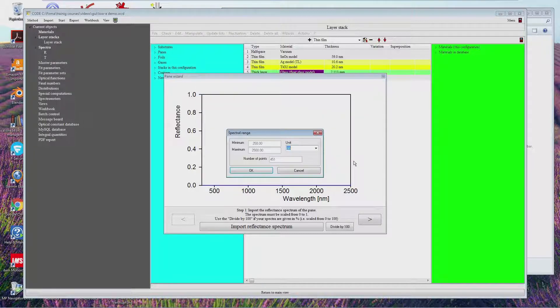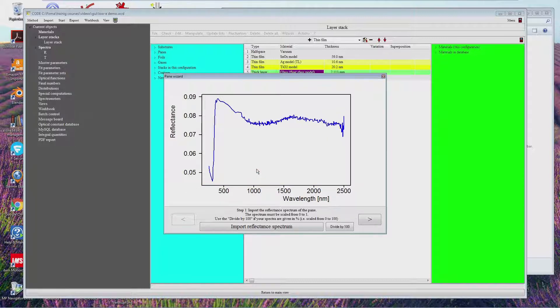This is the reflectance spectrum. When we read measured data, we get the spectral range and the number of data points, and we have to confirm the spectral unit — in our case, this is nanometers. Here you see the measured reflectance. You have to make sure that this is scaled between 0 and 1. In many cases, experimental data come scaled between 0 and 100 — percent values. Here we need scaling between 0 and 1, so if you have percent, the value would be in the order of 8 instead of 0.08. Then you have to click 'divide by 100' to rescale.